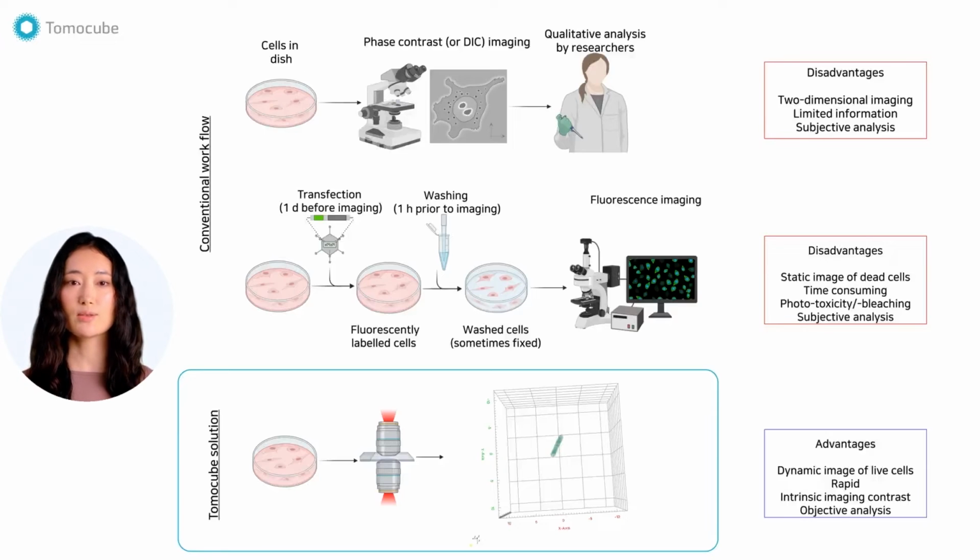One crucial issue is that cells are significantly modified from their native states and should be avoided for long-term investigation. Furthermore, the obtained images are qualitative. Researchers do subjective assessments by observing cellular images represented with imaging contrasts with arbitrary units.